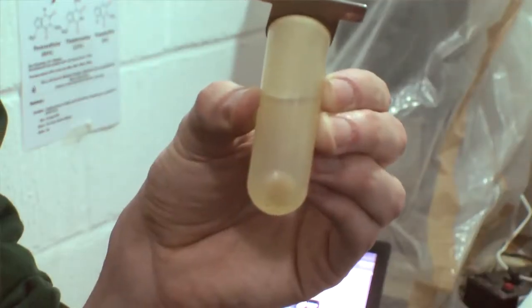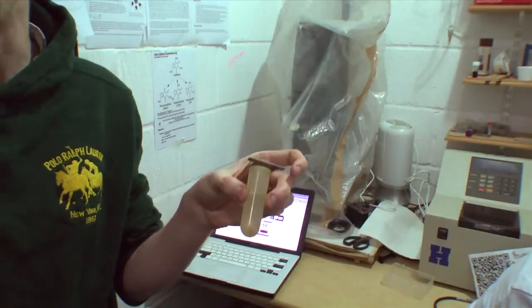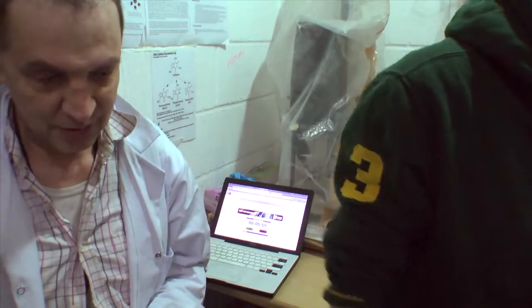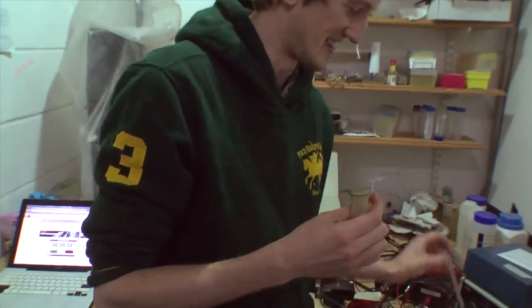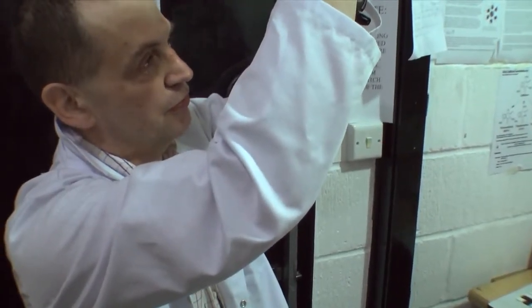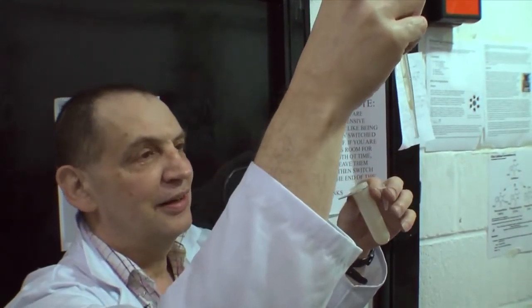It should look like that. Oh yes, I've got quite a pellet there. See if you can get anything out. You probably just didn't swish hard enough. So everyone take a tube and a pasteur pipette and try and get your pellet into the little tube. Oh, success! There's a happy man with his pellet.